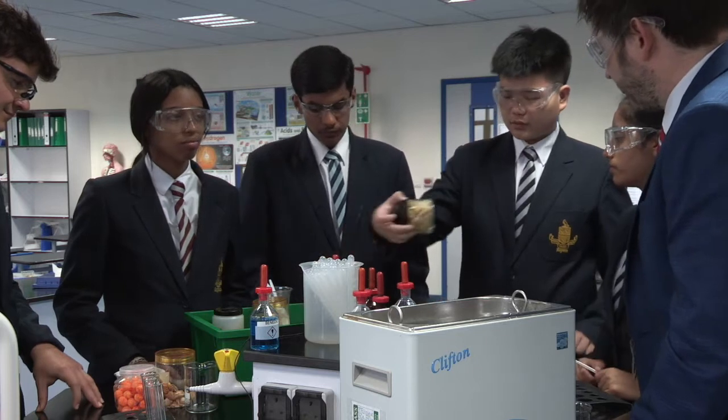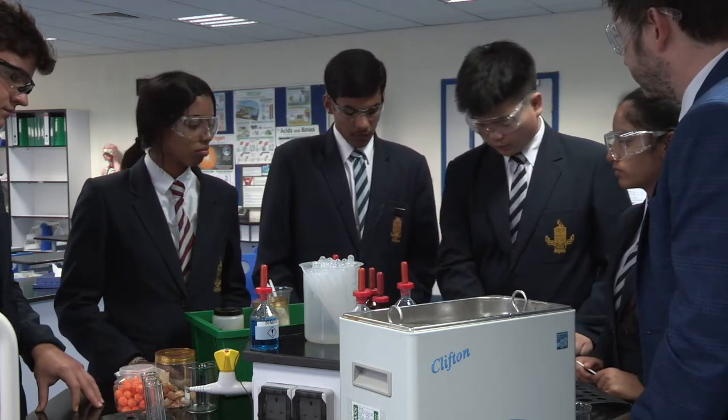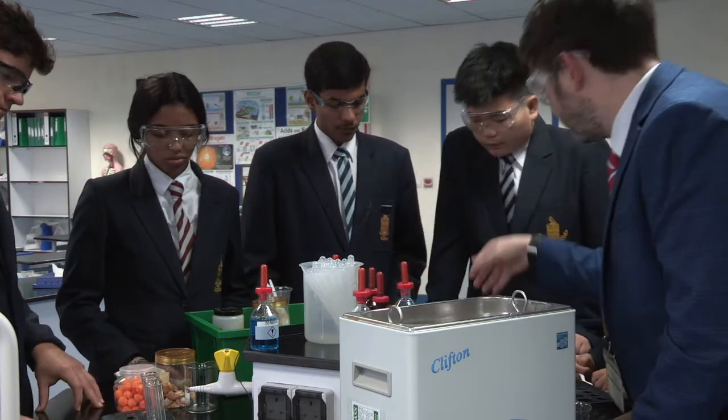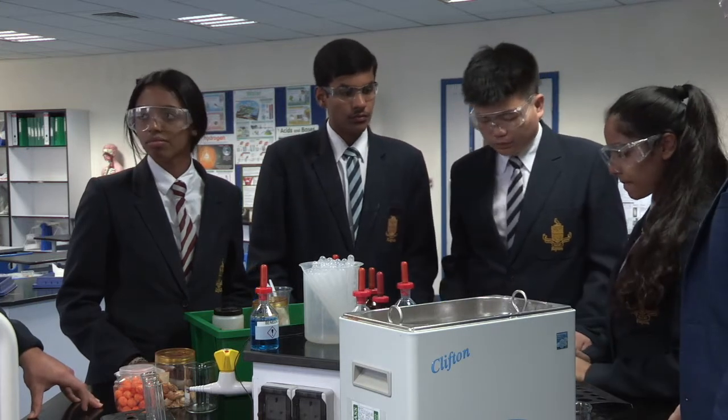What do we need to do to make sure we keep this a valid experiment in terms of how much food we put in? We should put the same amount. You can do that by volume, you can use the measurement balance — totally your choice, this is your experiment, you go for it.